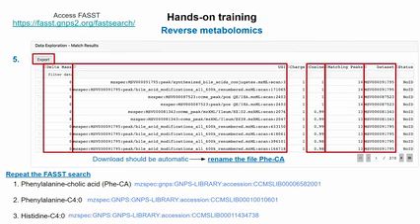If you have only 2 peaks in the spectrum, then for sure your false discovery will be a little bit higher. But if you have good intensity, a lot of peaks, and for example here you have 14 matched peaks with a cosine of 1, then that would be good, right? So usually you should do a manual inspection of your MS/MS spectrum before choosing it.